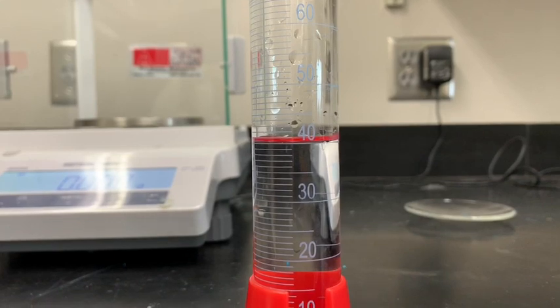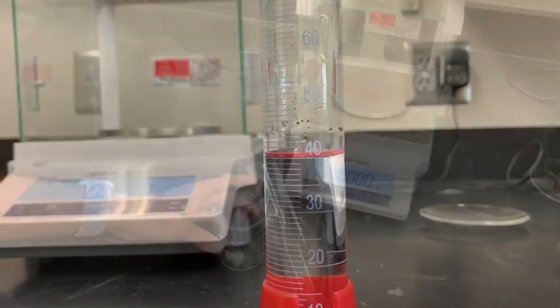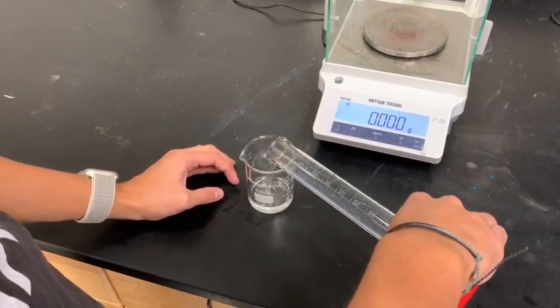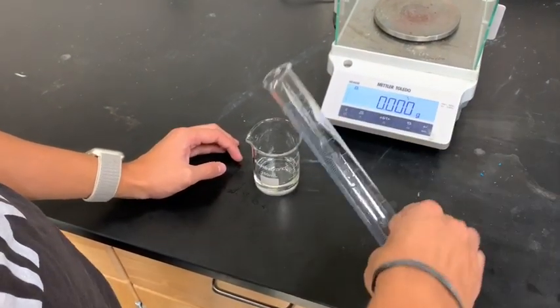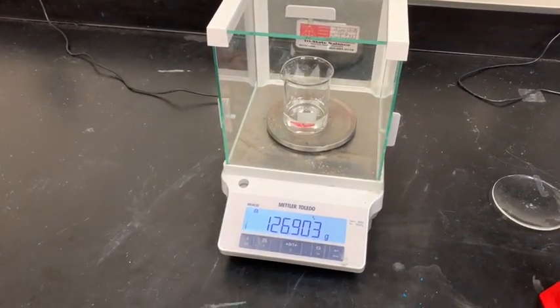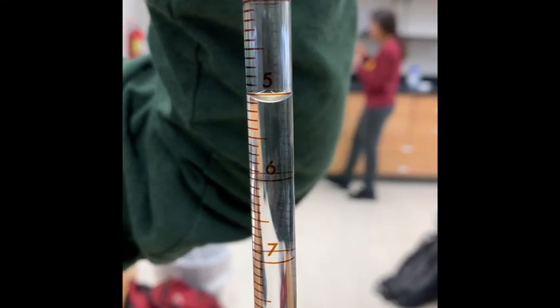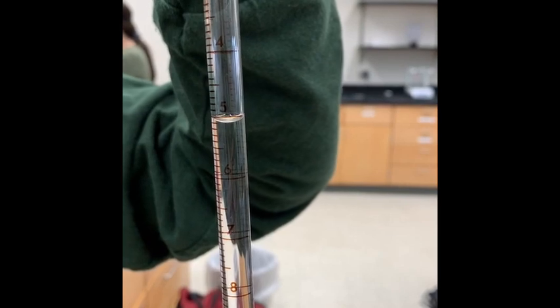We are now measuring the mass of 40 milliliters of water from the graduated cylinder. The meniscus is a curved upper surface of a liquid in a tube. The concave meniscus occurs when the molecules of the solution are attracted to those of the container.